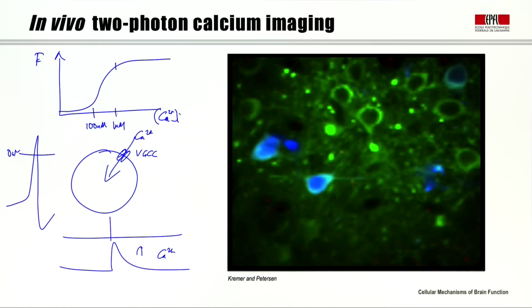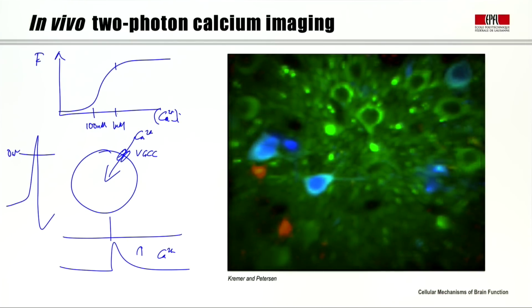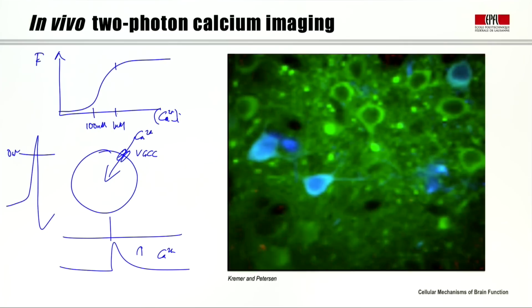Blue in this image indicates genetically defined populations of GABAergic neurons. Superimposed on this, we're going to have an orange color that indicates changes in the fluorescence of the calcium indicator that then reveals the function of these cells in real time. So here's the image of the brain, and you'll see that cells are lighting up, flashing as they fire action potentials. You'll also see that the activity is relatively sparse, and that's typical of the neocortex, that only a few cells are active at any given time.